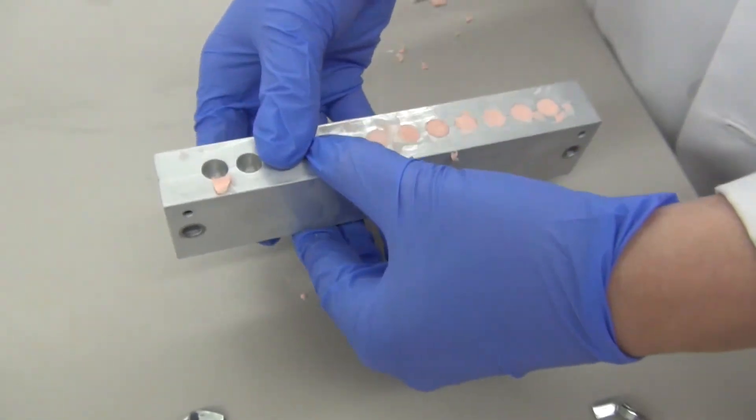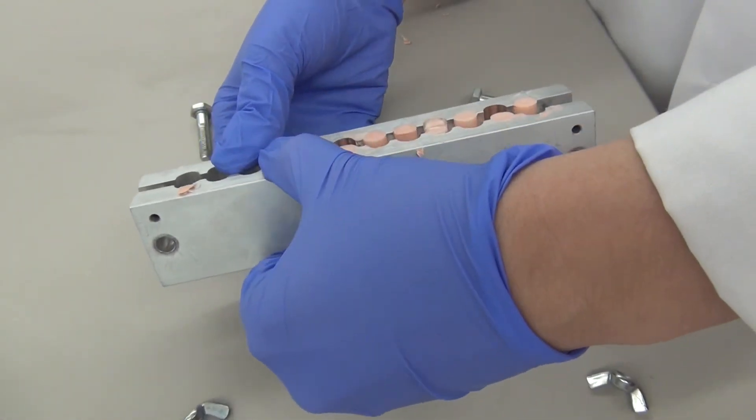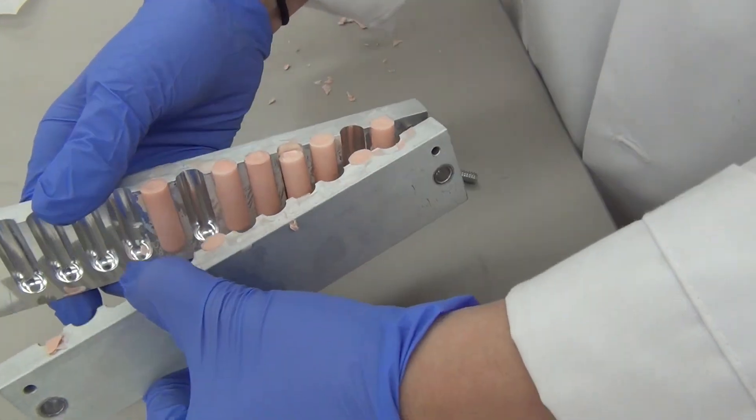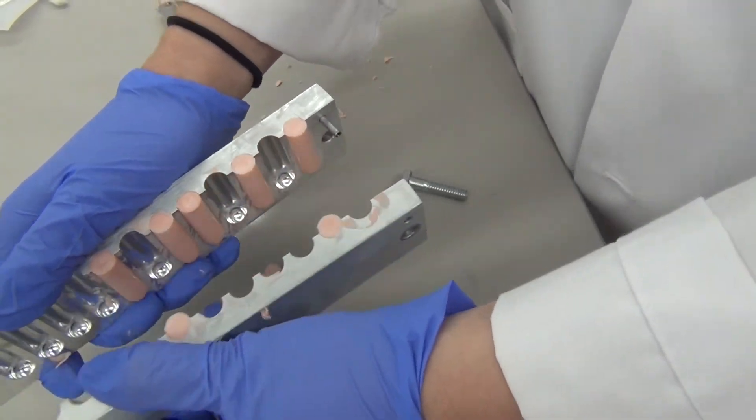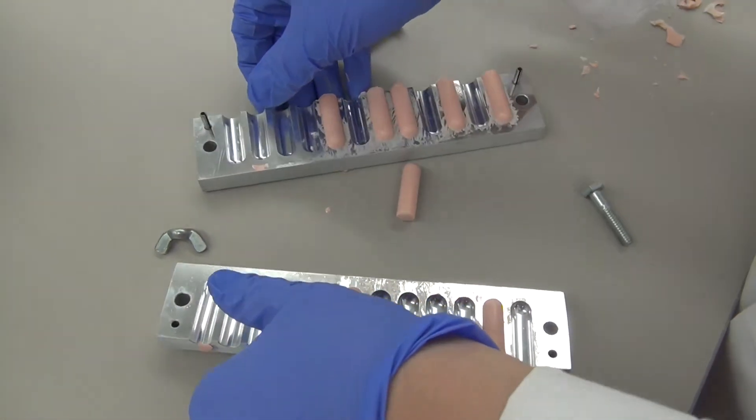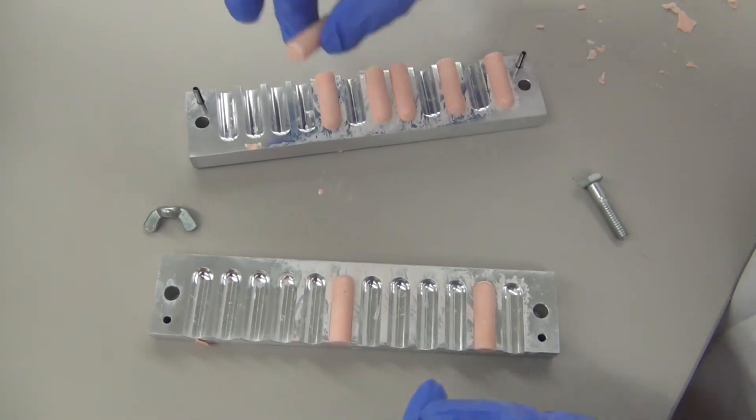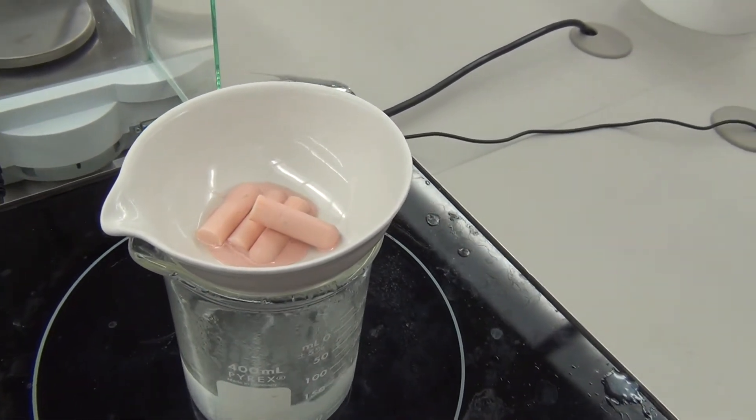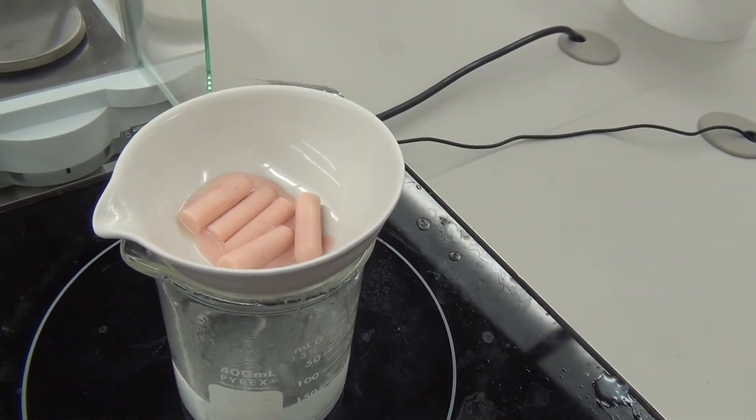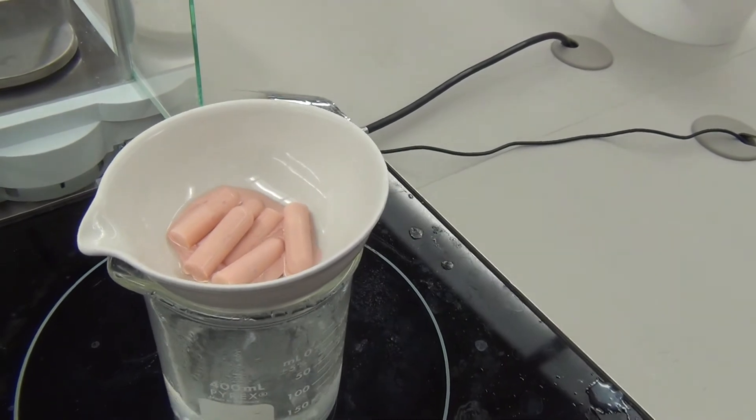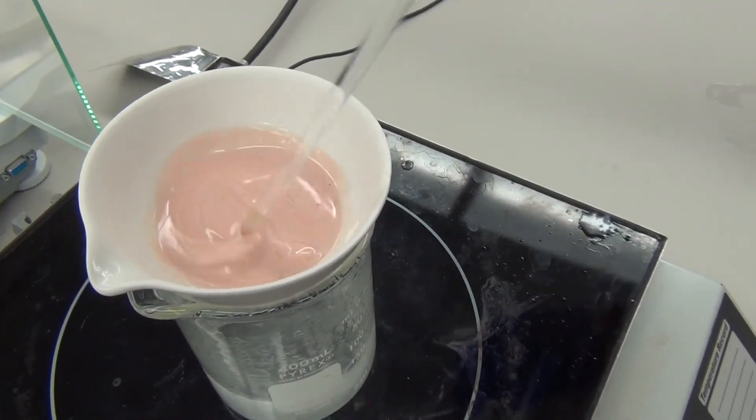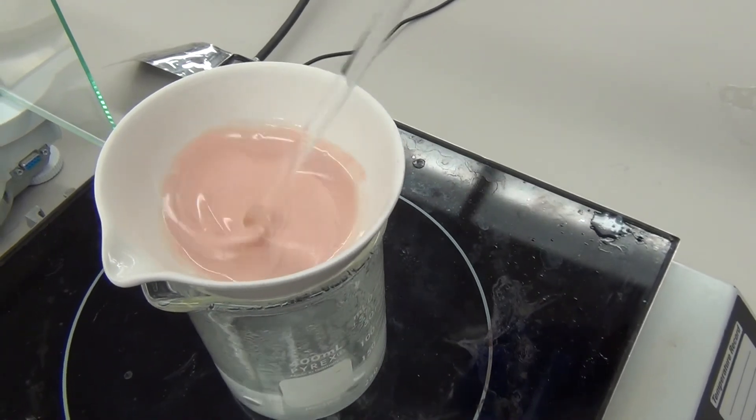Open the mold and remove the suppositories. You are now going to re-melt the suppositories using the evaporating dish and the water bath. This is why this procedure is known as the double pour method. You would use the double pour method if your prescription called for a large quantity of drug.